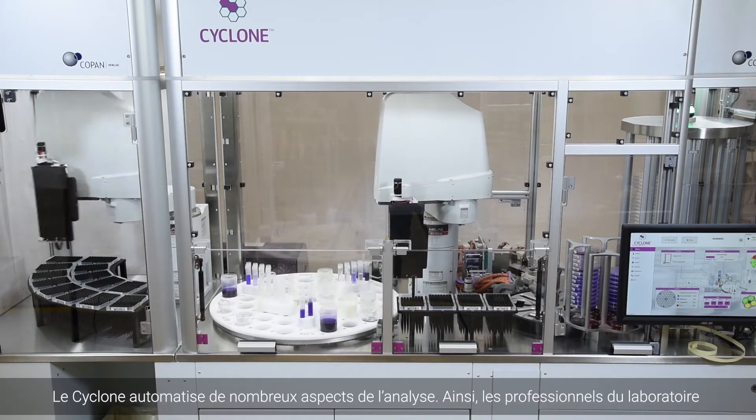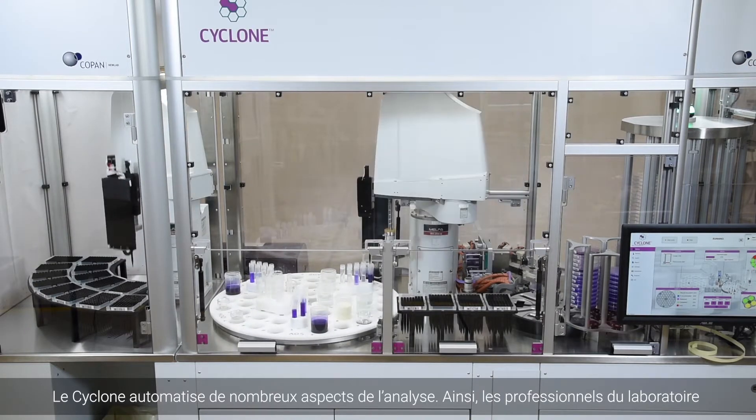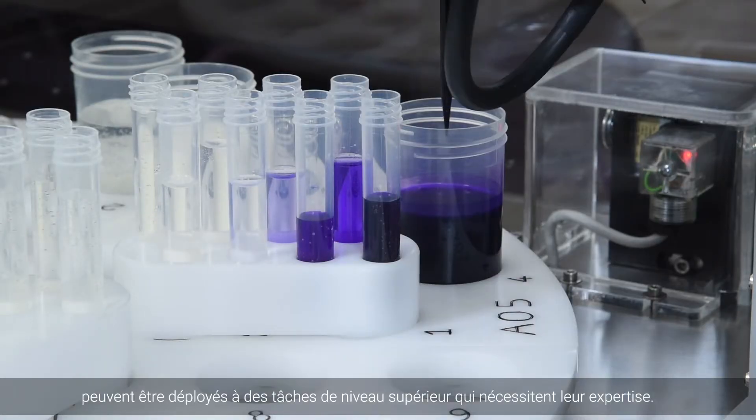The Cyclone automates many aspects of sample processing so laboratory professionals can be deployed to higher level tasks that require their expertise.